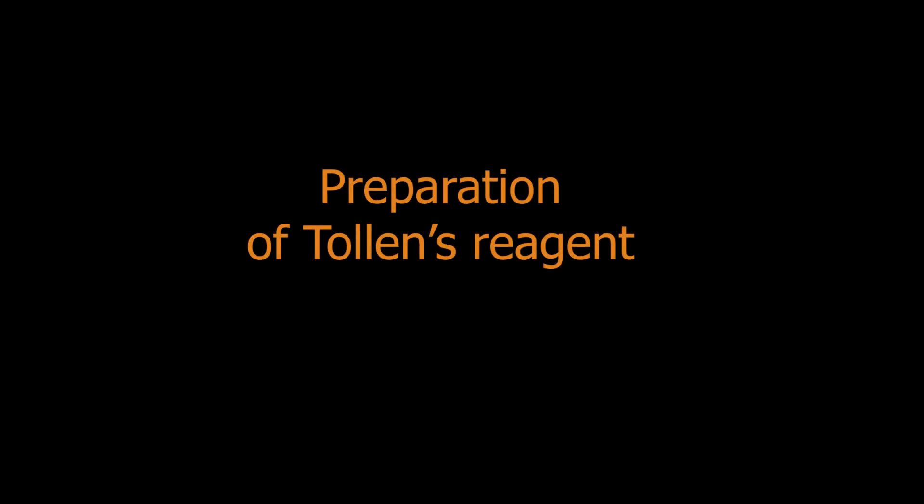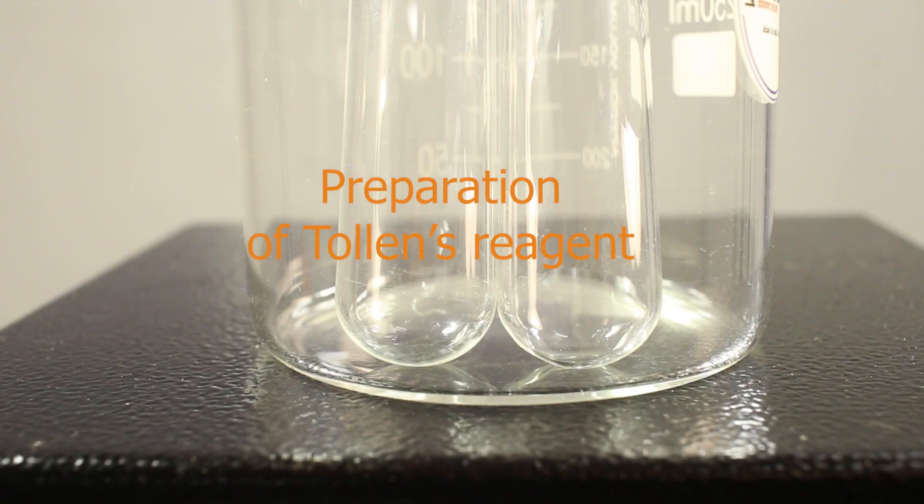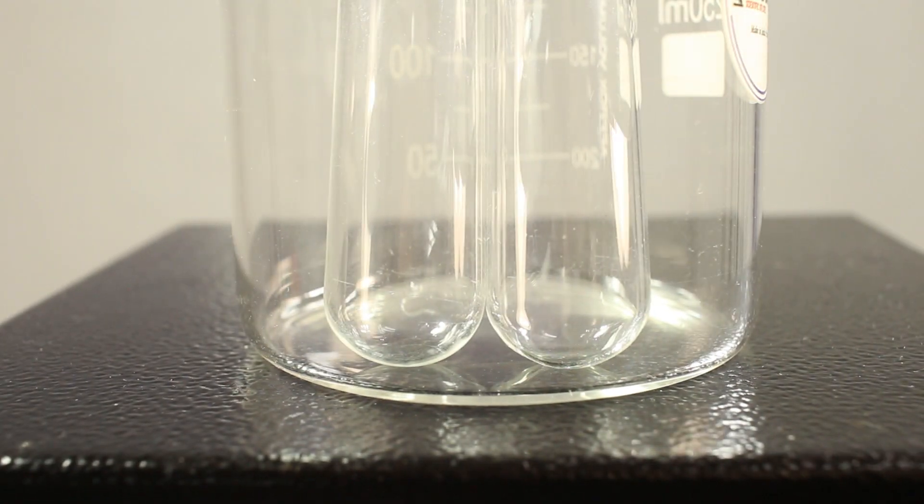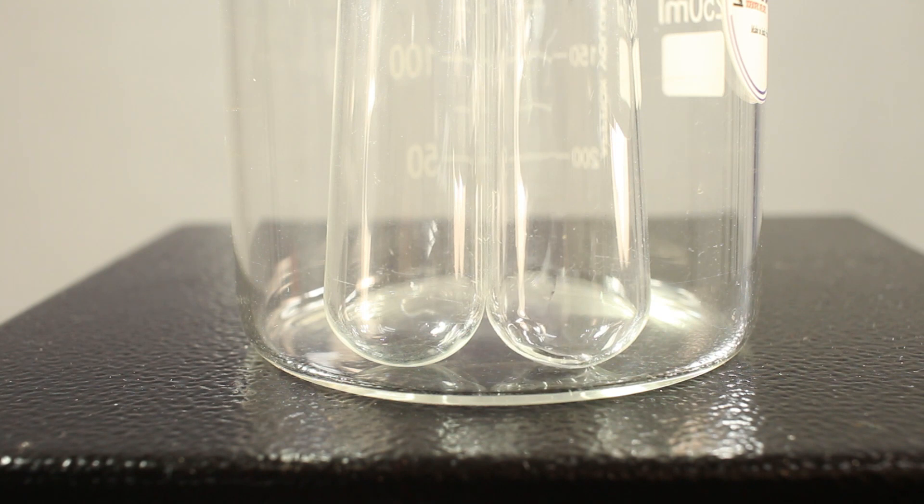First, we have to prepare Tollens reagent though. Tollens reagent is essentially an alkaline solution of silver-1 ions. They can be kept in solution because they form soluble complexes with ammonia molecules.